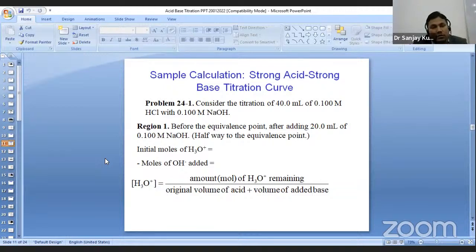We can see this with the help of a table, where we have serial number, initial reading, final reading, and concurrent reading, or you can say average reading, and finally we calculate the concurrent reading with the help of the N1V1 equals N2V2 formula.